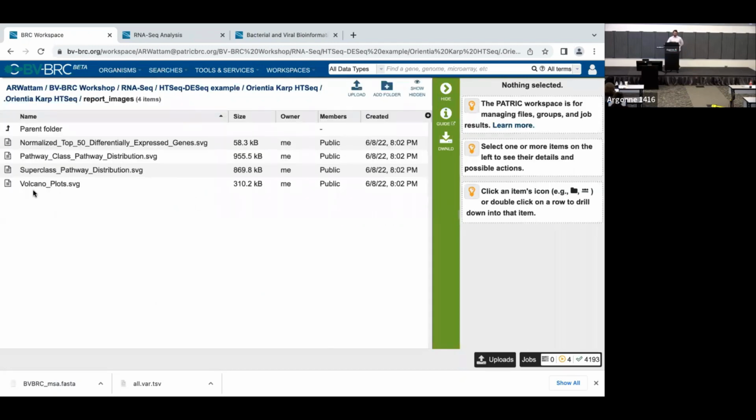So the question was, do we provide a workflow on how you can generate these images yourself so you can play around with the colors, make it something more appealing to you? And that's something we're trying to put together so that you can take the raw output that we provide you and you can customize it as necessary. Not available yet, in progress.